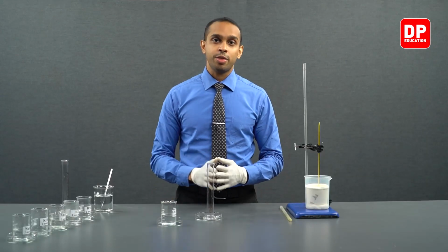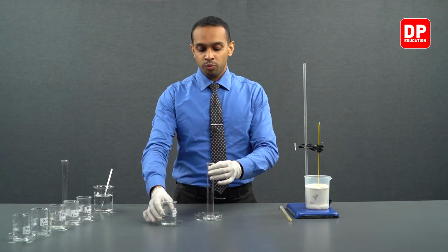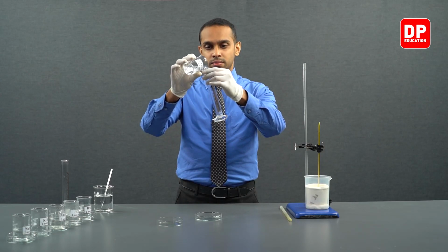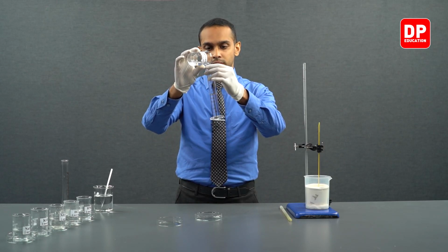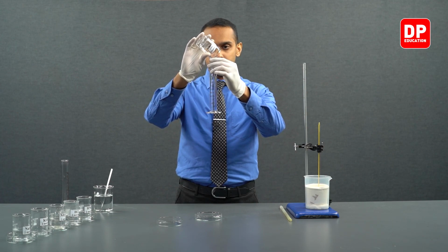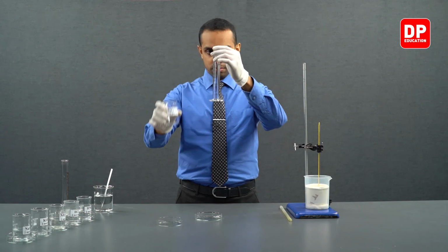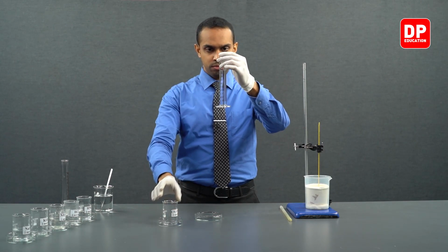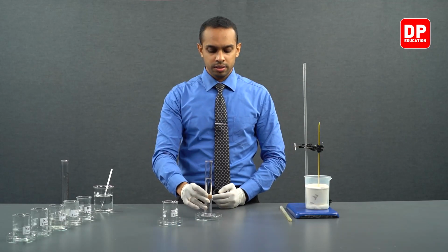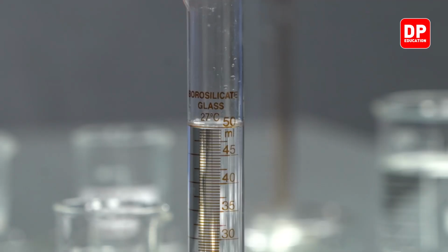We will take our ethanoic acid, and now we are going to measure 50 milliliters of this acid. Now we have measured 50 milliliters of that acid. Now let's transfer it into our beaker and measure the temperature.